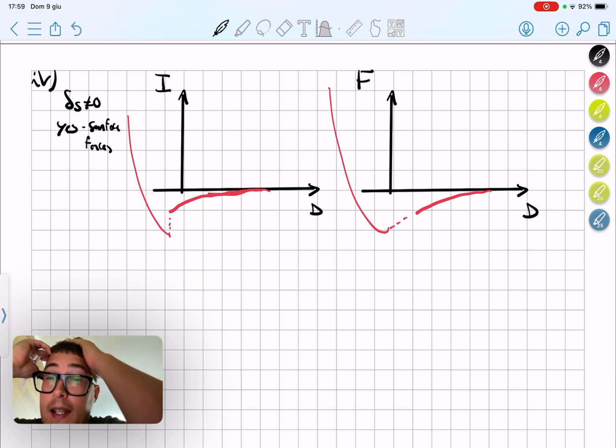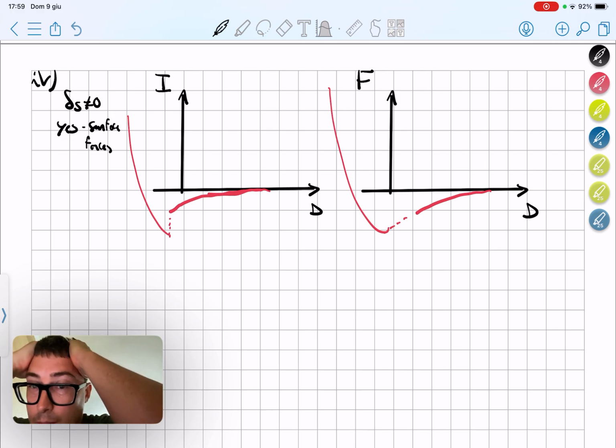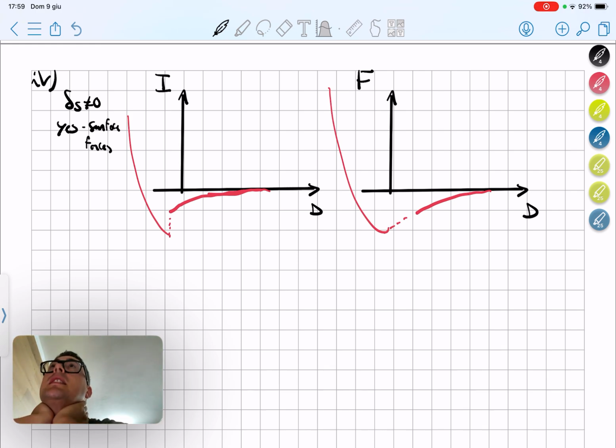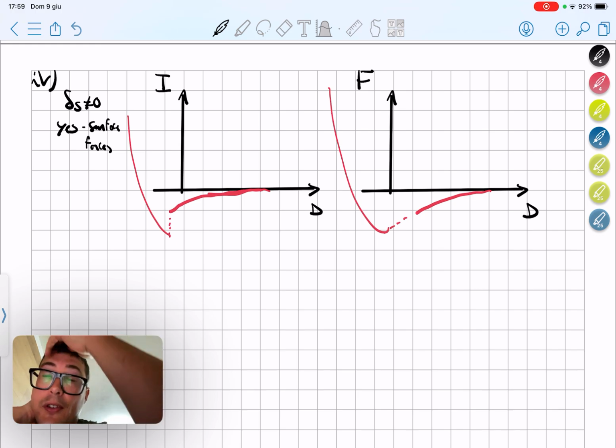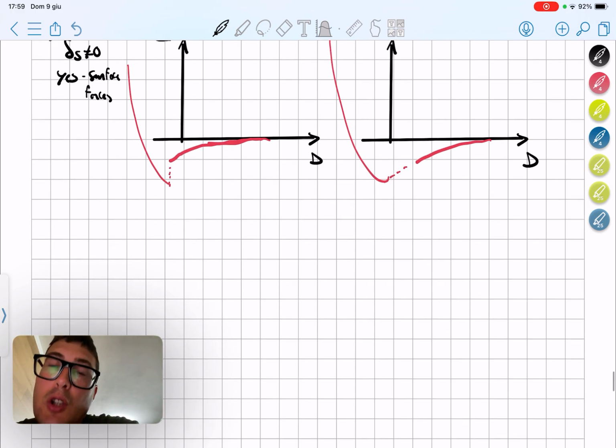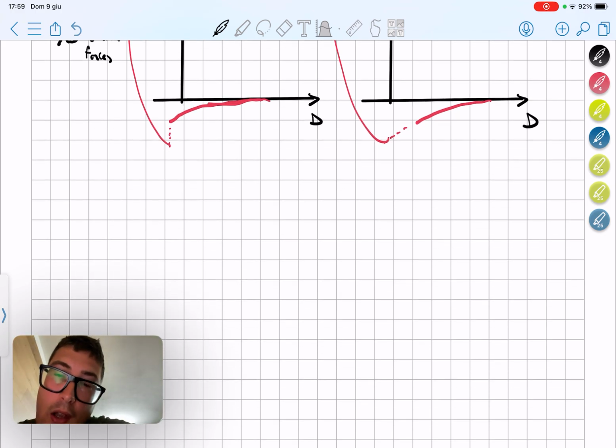But this is what it is, and this is what we need to describe. What is limiting this is, of course, some thermal fluctuation and some noise in our measurement, but definitely the atomic resolution can be achieved. What are the types of mode to run this atomic force microscopy?